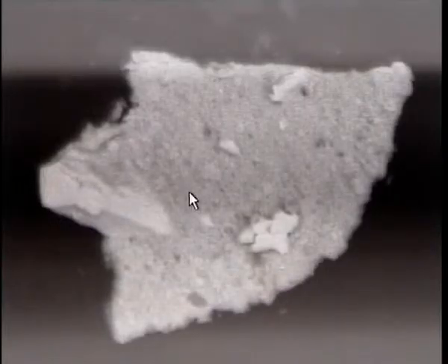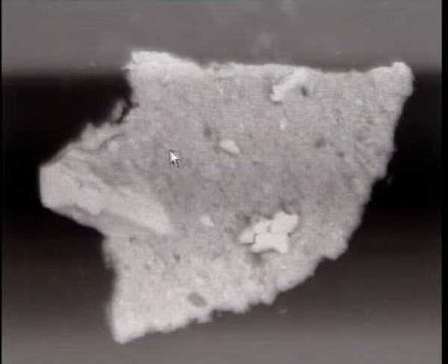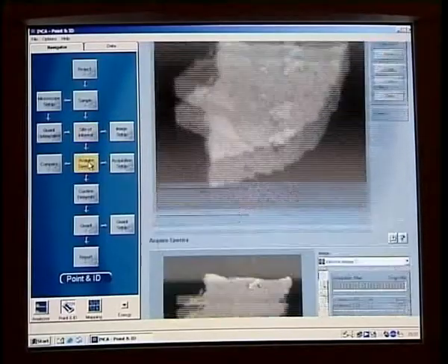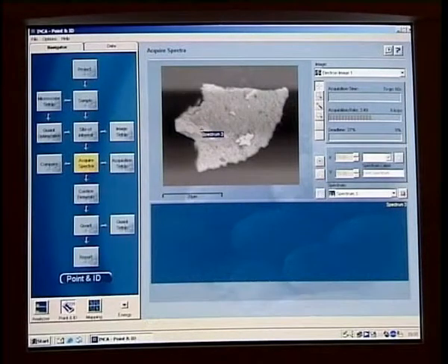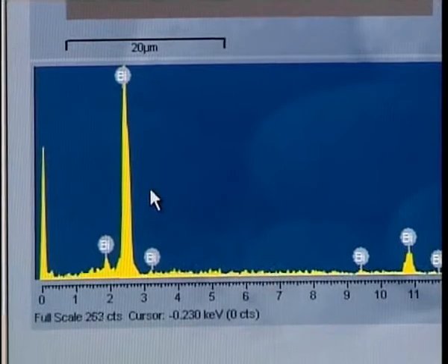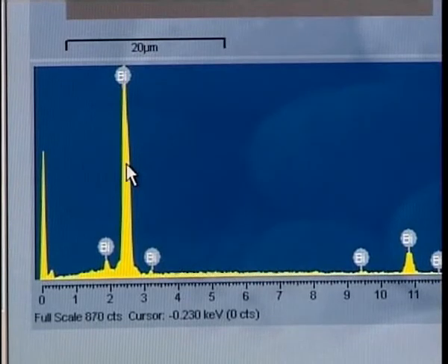This is the image created by the electrons in the scanning electron microscope. The contrast in the image is created by differences in the composition of the pigments, so some pigment particles appear light grey and some appear a darker grey. This large light grey particle here is the pigment that we're interested in, which appears as if it's small particles of metal under the light microscope. We can now place the cursor onto this metallic particle and analyse this one particle, and this produces a spectrum with peaks showing the energies of the x-rays that are generated.